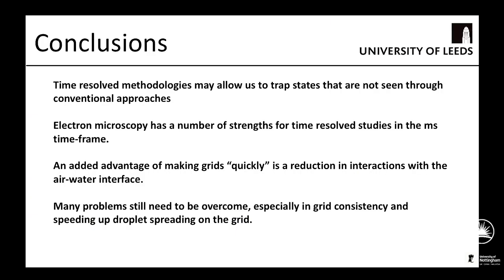And so with that, I just need to say that I think time-resolved methodologies can allow us to trap states not seen through conventional approaches. And I think it's a really neat technique that EM can really dominate in terms of looking at these millisecond and microsecond different states, particularly because we're not confined by a crystal lattice. So that really helps in terms of looking at large macromolecular motions. And there's a number of large protein complexes that we can look at, burying themselves into membranes, transporting over membranes, all these sorts of systems that we can start to unlock using these techniques.